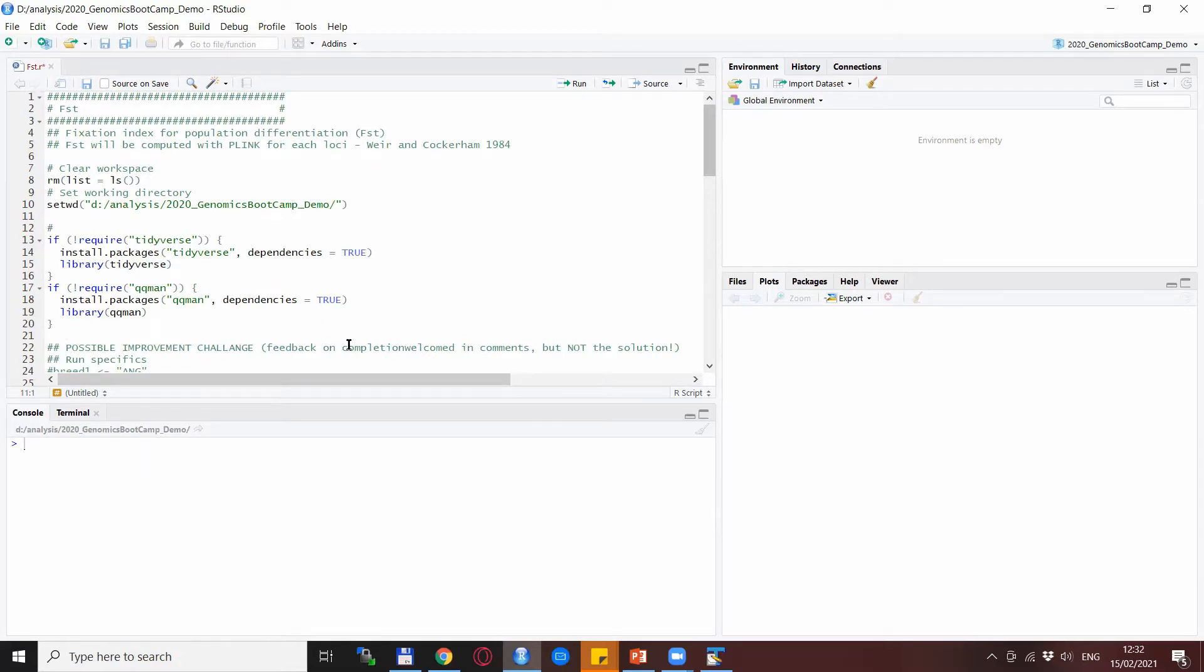This will be used to create a very neat Manhattan plot at the end of the script, to visualize the results in a quick way.